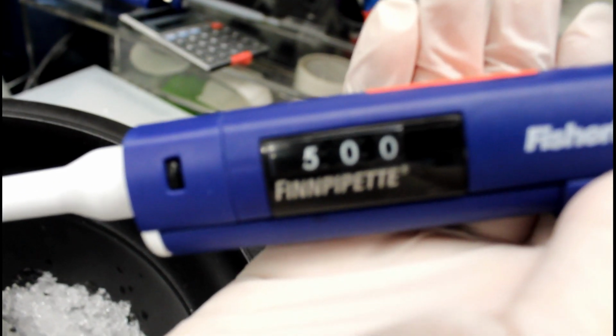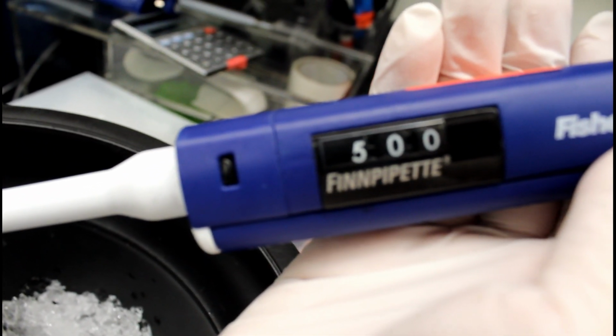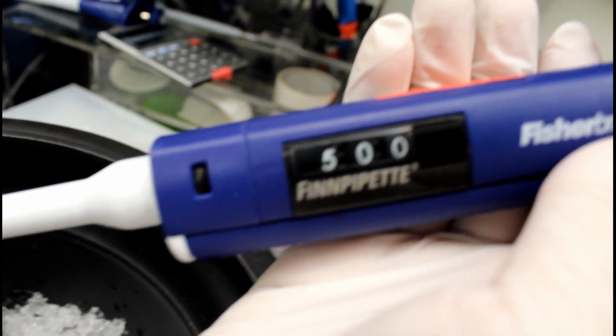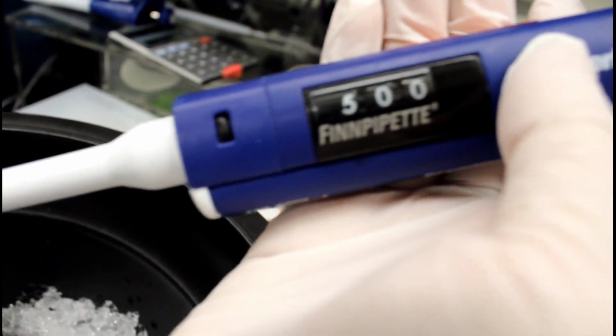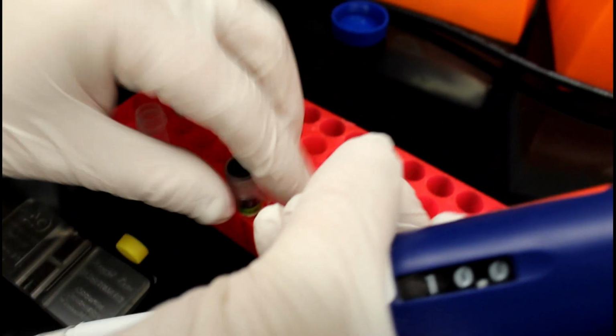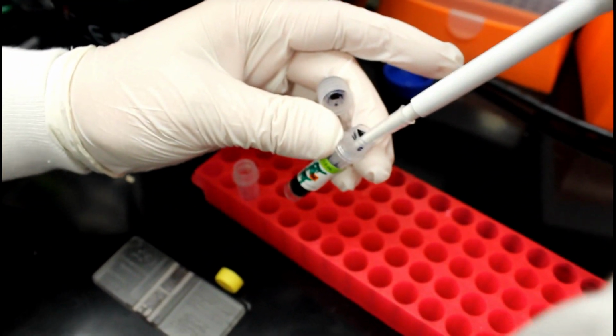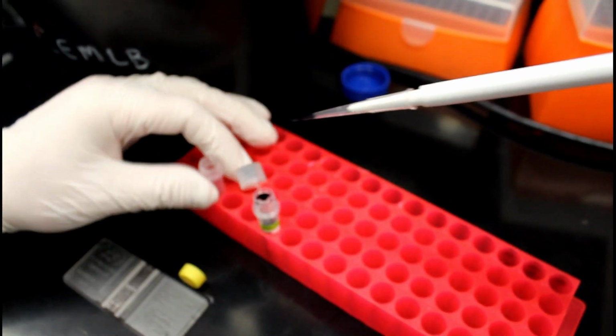After the supernatant is removed, you will resuspend the cell pellet in 0.25 to 2 mLs of cold DPBS depending on the thickness of the pellet. In this case, we'll be adding half a mil of buffer to the cell pellet. Next step is for cell counting. First, take 10 microliters of the cell suspension and add it to 10 microliters of trypan blue stain.